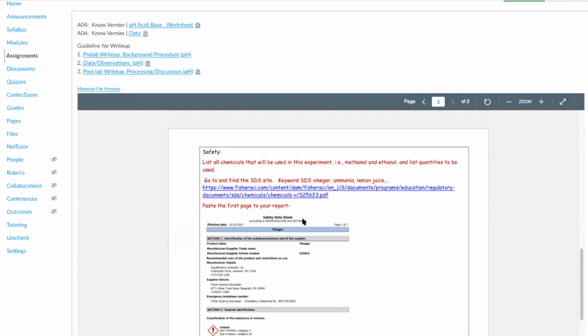And then, of course, the safety. What are the chemicals that are being used? And yeah, something like 7-Up, for example, there's a number of acids in that. If you ever take a look at the active ingredients of these soda beverages, they're listed in terms of the most abundant first.